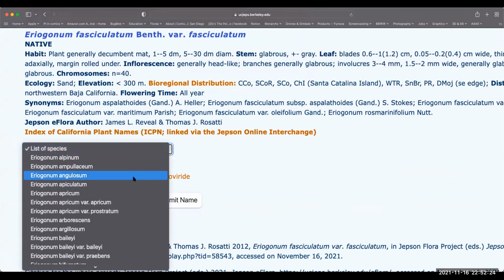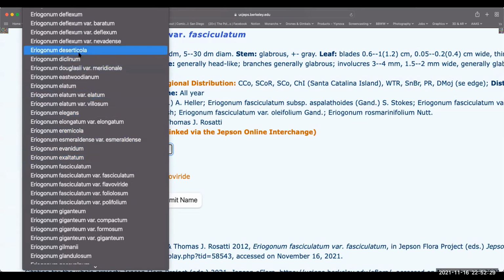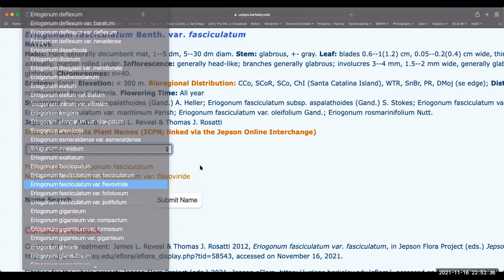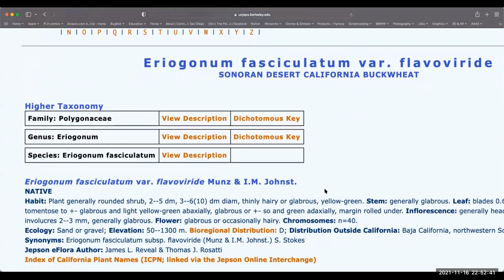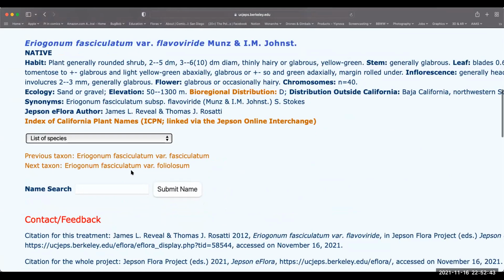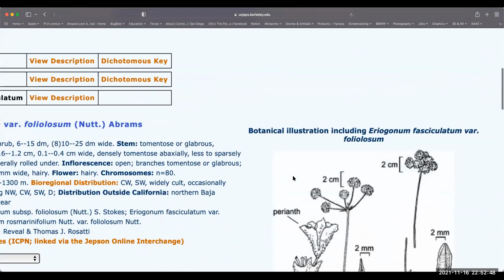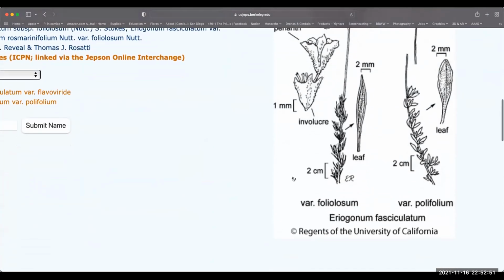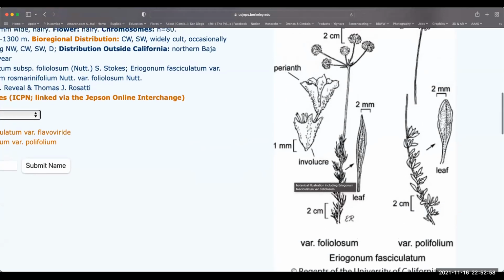Now what we're going to have to do is look for other Eriogonum fasciculatum and try to find a drawing of it. So here, this one here, now you wouldn't know this, but variety flavoviride is only found in the Sonoran Desert, like Anza-Borrego Desert State Park. Let's not do that one. Let's choose another. Here's variety foliolosum. Let's just see if that's drawn out here, and look, that it is. Okay, so variety foliolosum and polifolium, both of which are here in Orange County as well, are drawn here.